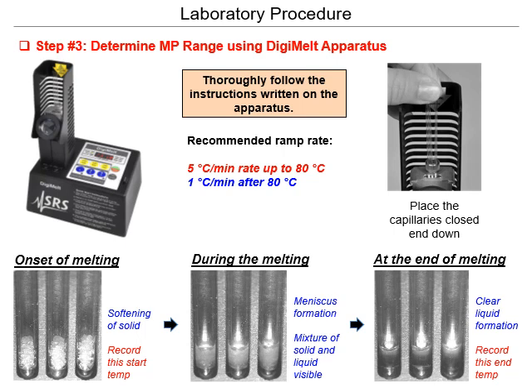For this, unless it's one of the 100% benzoic or 100% naphthol, we already know it's a mixture. So they're going to have a longer range. It could take 2, 3, maybe even 5 degrees centigrade. So you might need to be watching it for a while, but you would always just watch it, record the initial part, record the final part.